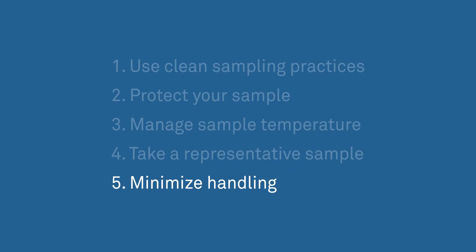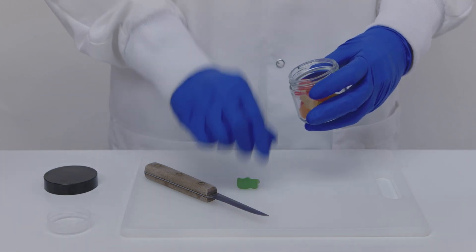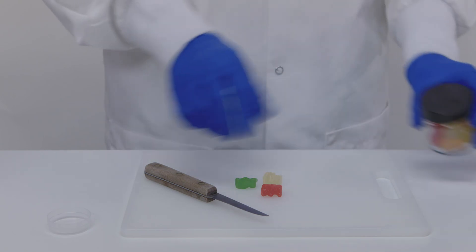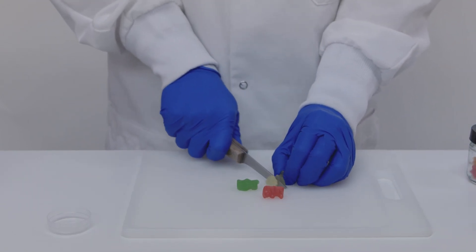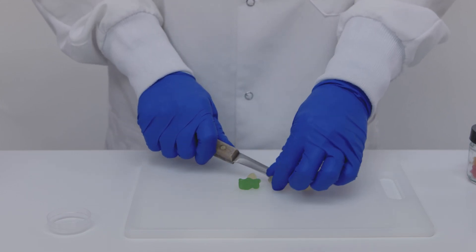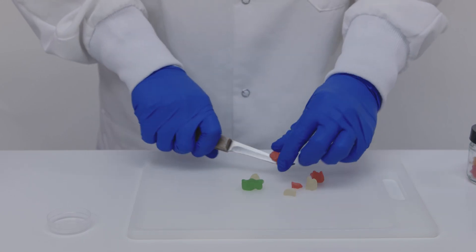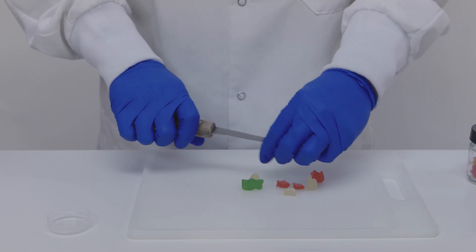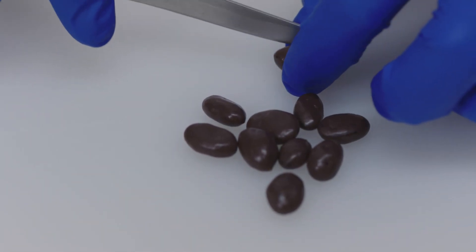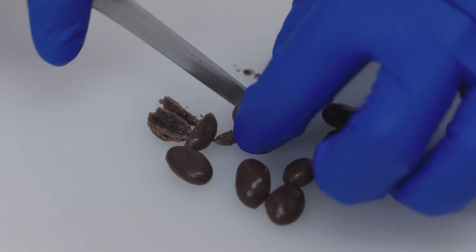Five: minimize handling. In sample preparation, less is more. We've seen customers use all kinds of sample prep methods, including grinders, food processors, and blenders. There are two problems here. First, the friction of the grinding process heats the sample, driving off moisture and changing its water activity. Second, the increased surface area means that the product loses or gains moisture more quickly, making it more susceptible to the effects of room humidity.